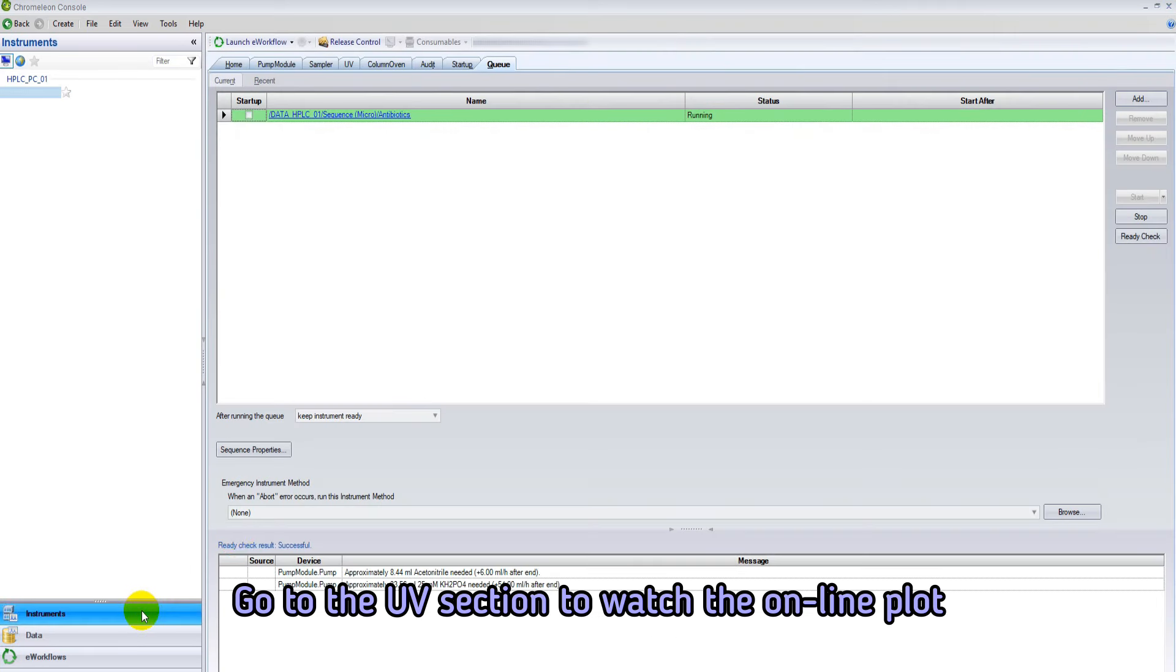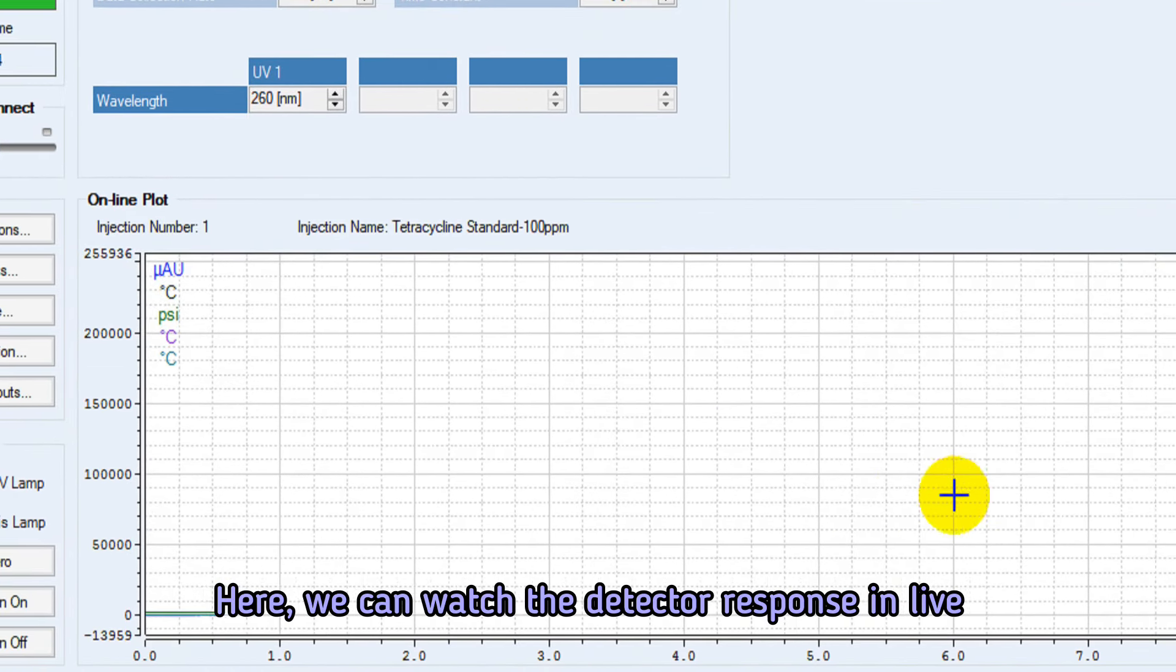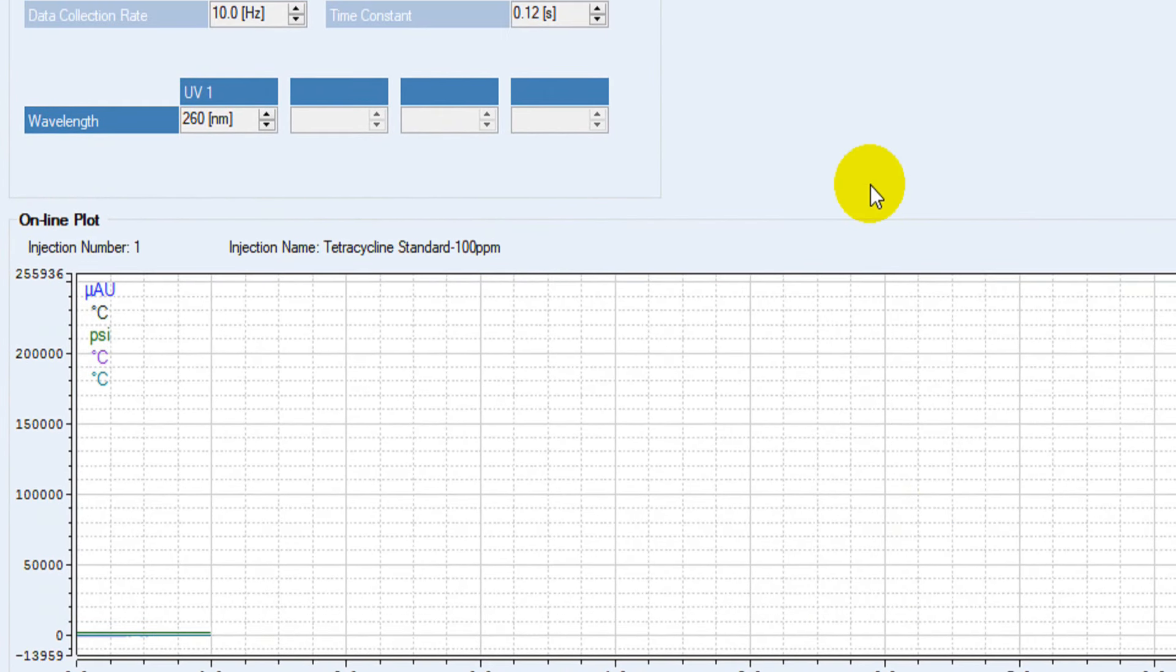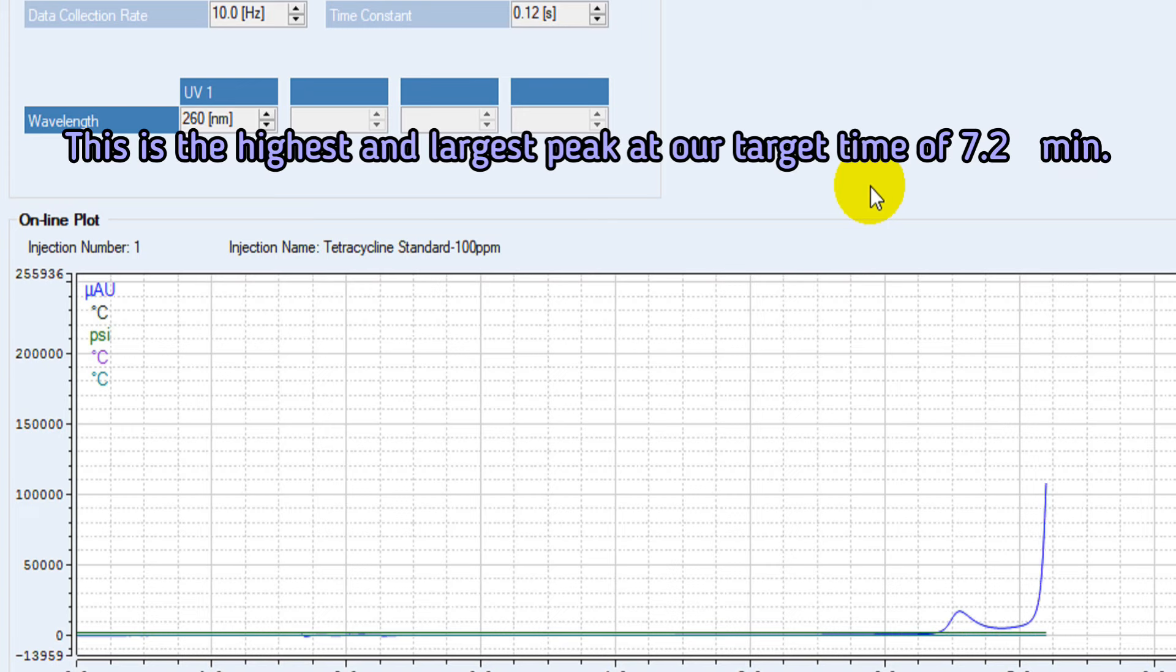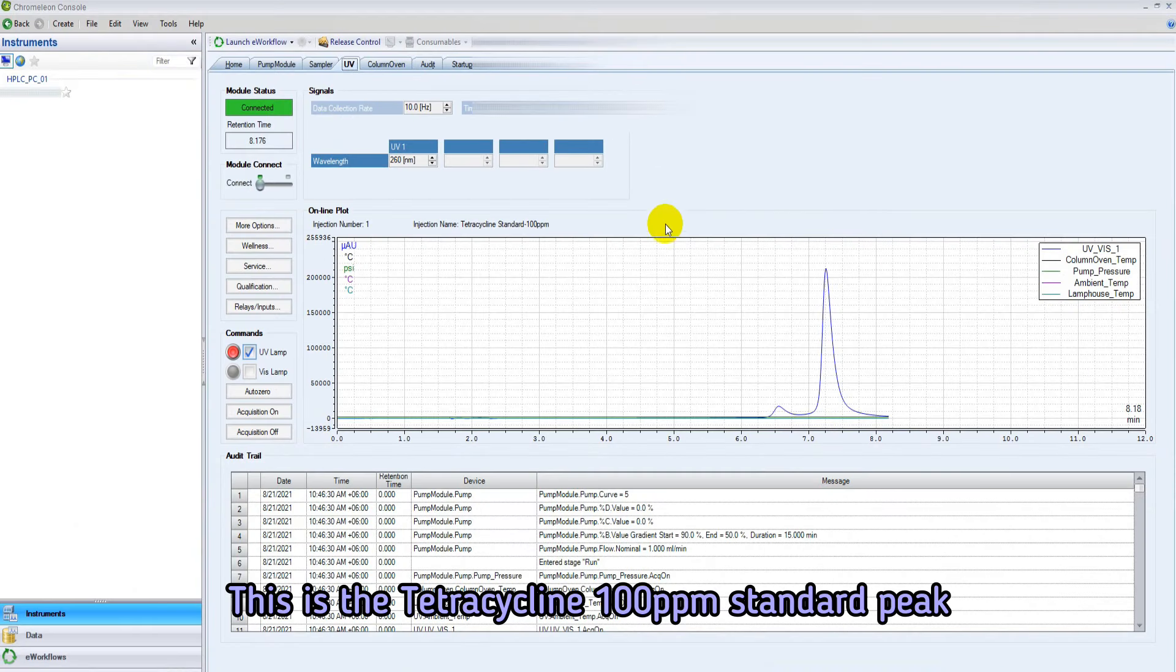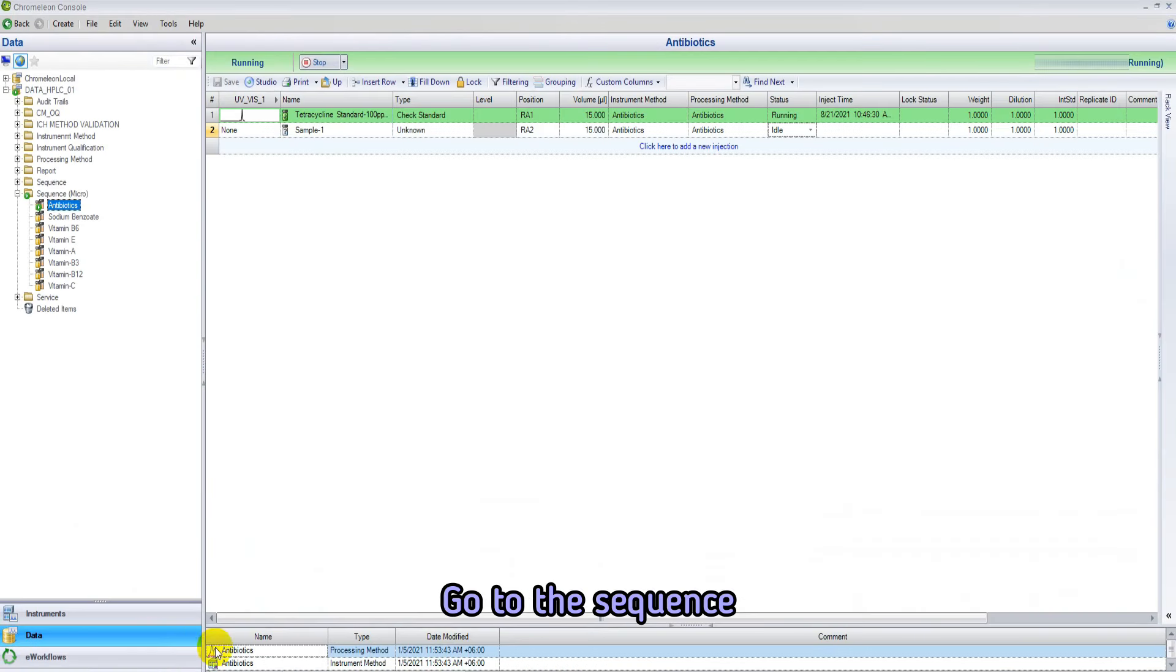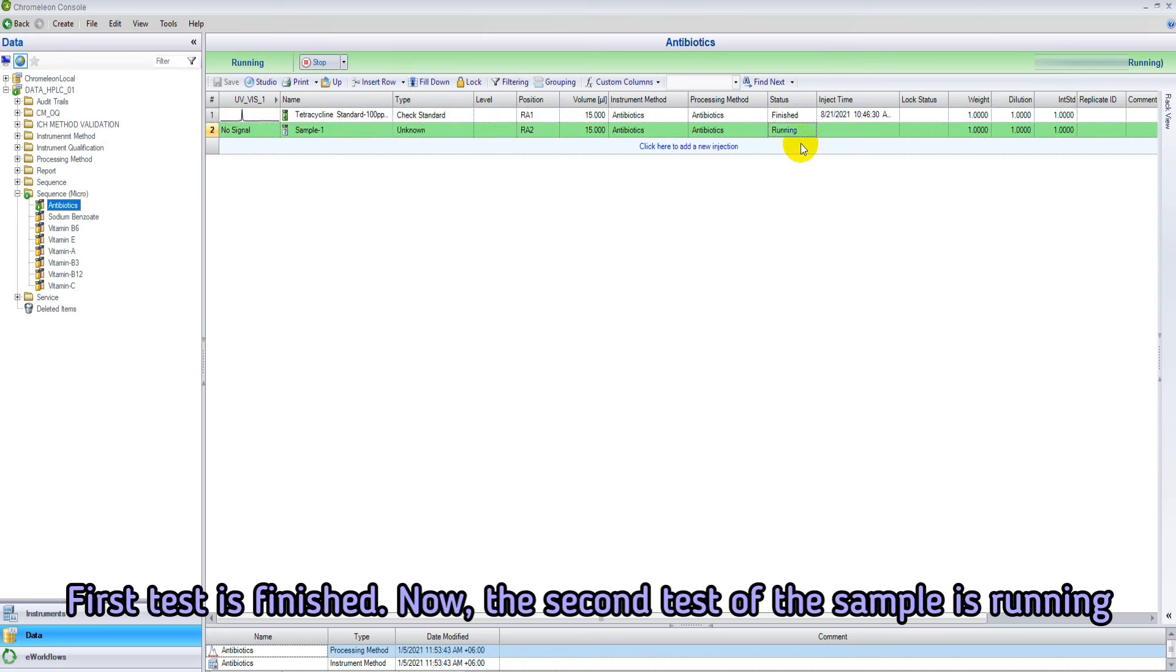Auto sampler is taking 15 microliter of tetracycline standard from the selected position RA1. Go to the UV section to watch the online plot. Here we can watch the detector response in live. This is the highest and largest peak at our target time of 7.25. The first test is done.